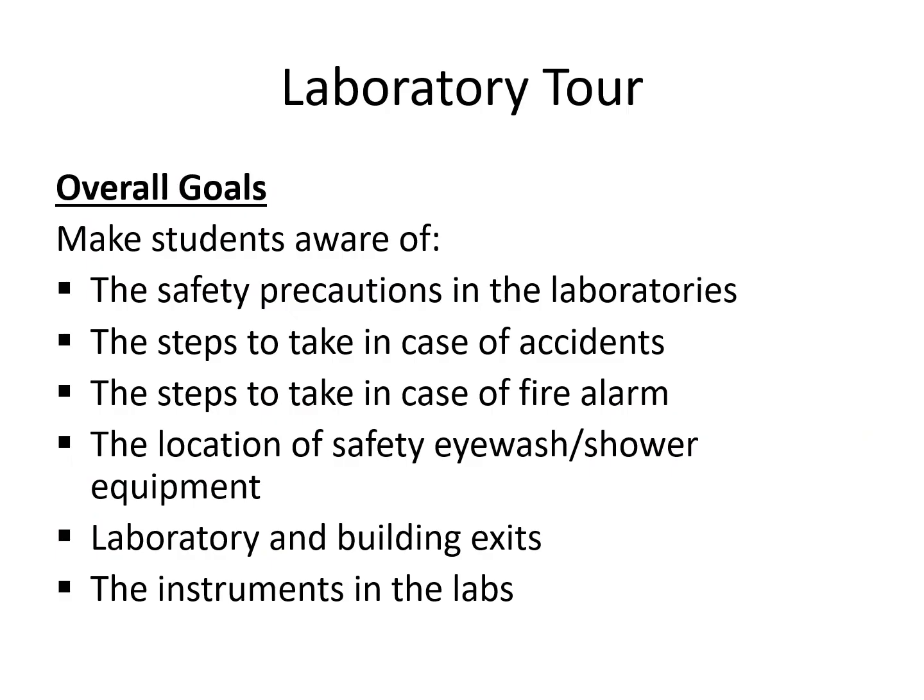Okay, normally at this point during an in-person meeting, we would give you a quick tour of the laboratory showing where all the facilities are, but of course, that's pretty impossible here since we're not allowed in the labs. But in terms of quizzes and what you might be asked later, just make sure when you go into any lab, you immediately find out where the safety showers are, the eyewash stations, the fire extinguishers, and any other safety protocol that is there. That's the most important thing. See where their exits are, see what's going on. In case of an accident, know who you need to call, know who you need to talk to. We'll go over that again in a second.